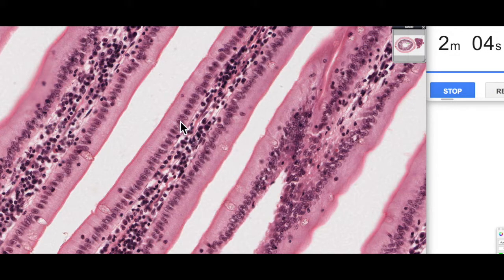Here's the nucleus and we can see it's stained purple by hematoxylin. You can see these little dots here, these represent the nucleoli. They're dense little bodies of RNA and protein, but RNA is the predominant component, so it stains very basophilic.